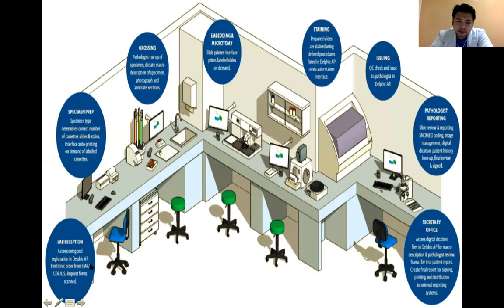So here's the reception. Dito nanggagaling or dito ni-receive yung specimen for specimen preparation. Specimen preparation class is checking for the labels. Okay, what type of specimen? Enough ba yung fixatives? Okay, grossing. Grossing class is cut a part of the specimen for histotechnique.